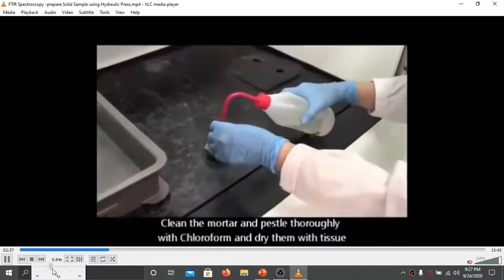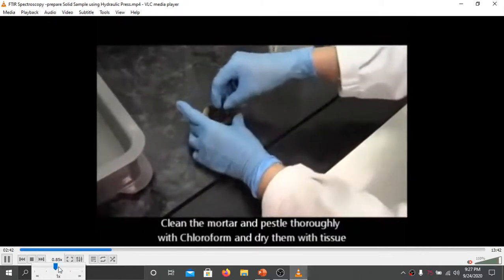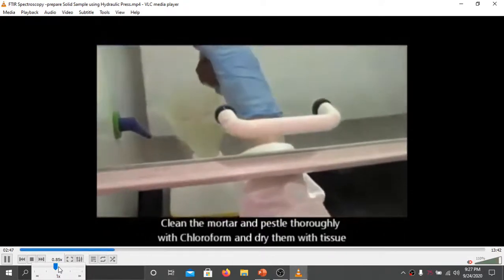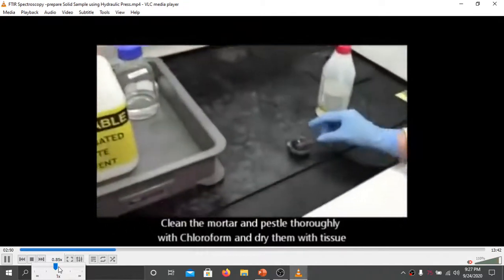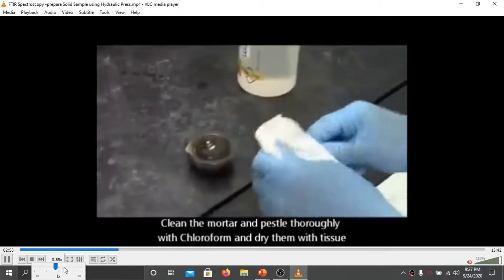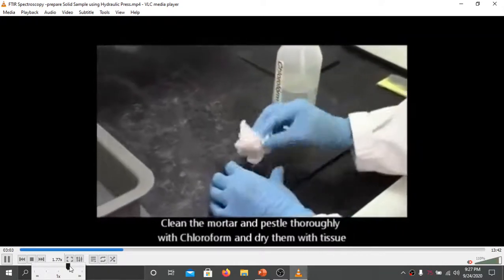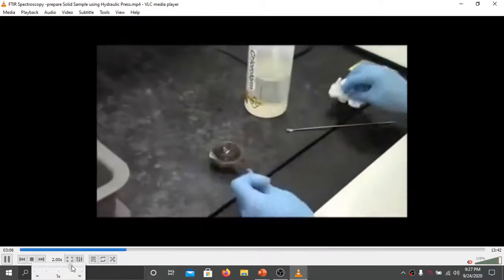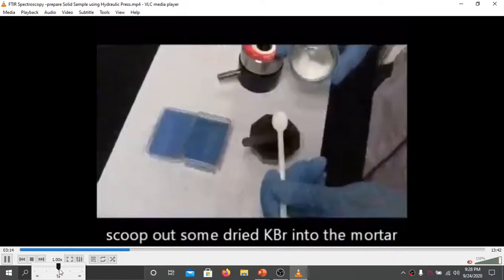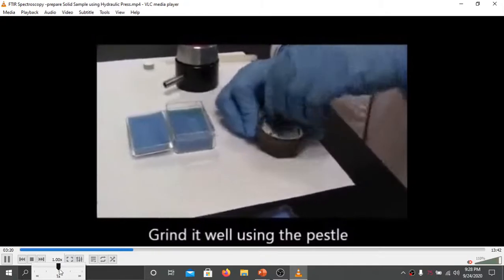The mortar and pestle which are used are again cleaned thoroughly with chloroform, because previous residue should not be there. It is to be thrown out. Then again it is dried with tissue paper. Now this is the dried KBr which is taken into the mortar and pestle. It is thoroughly ground to a fine powder.